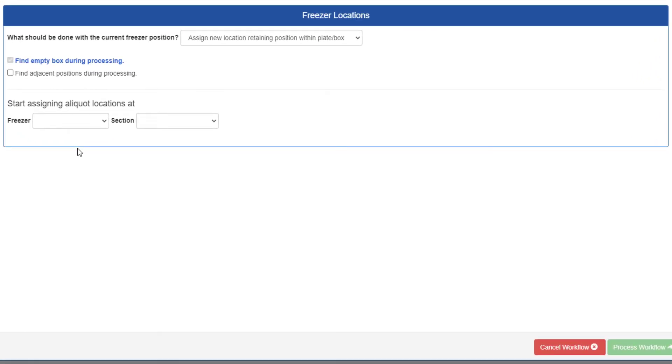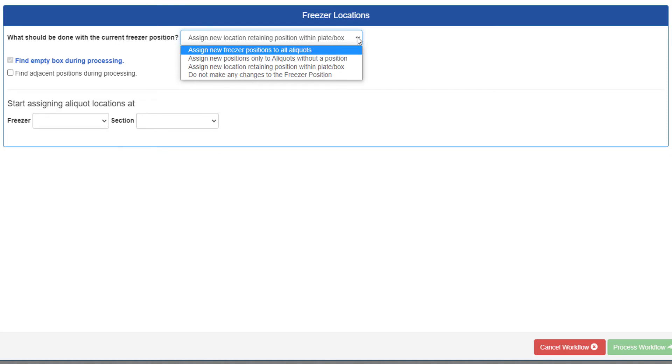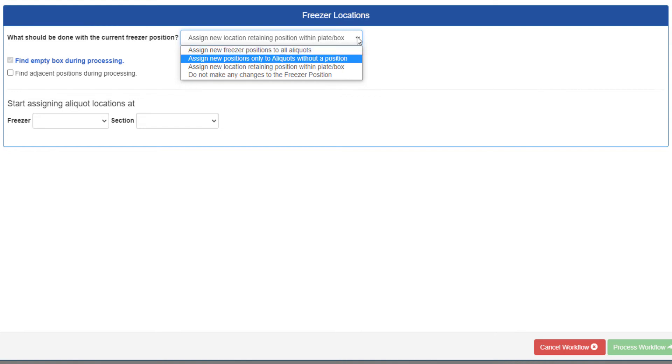First, you must choose what you want to do with the aliquots and their freezer positions. Your options will be as follows: Assign new freezer positions to all aliquots, which does exactly what it says, regardless of whether any of the aliquots already have positions. Assign new positions only to aliquots without a position, which will not change any existing positions.